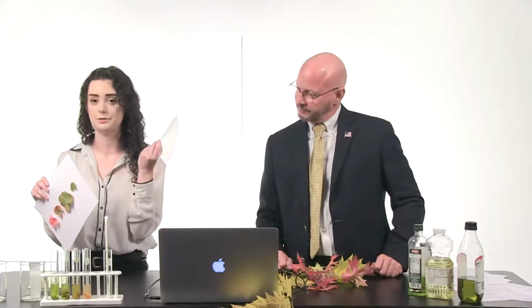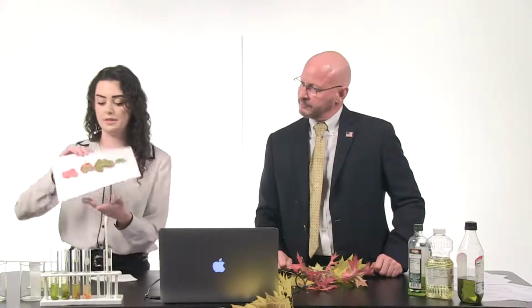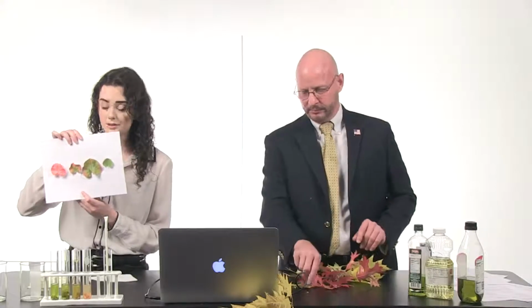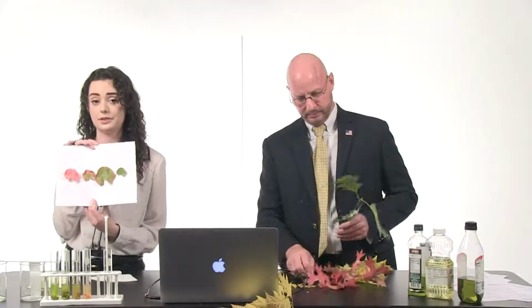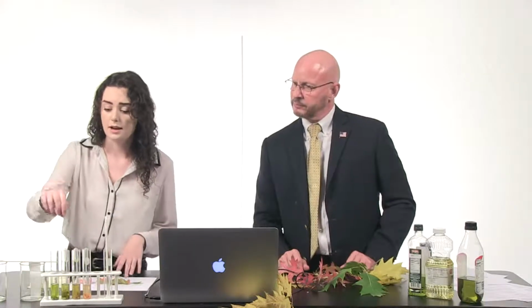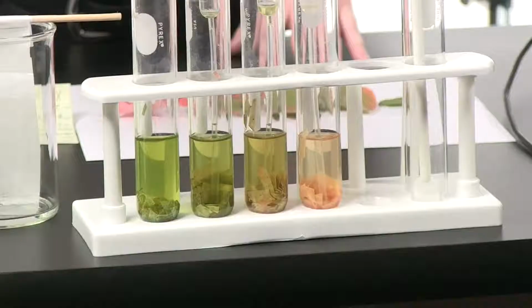What we're going to be doing is starting with an easy chromatography experiment that students can be doing at home. All you need is a little bit of filter paper, some leaves. Coffee filter paper? Coffee filter paper, yeah. This is just coffee filter paper from the store. And then these are 4 different leaves from the same tree out front of PASCO. You're just going to take some scissors and cut them up into very small pieces. And then you're going to put them into little containers.